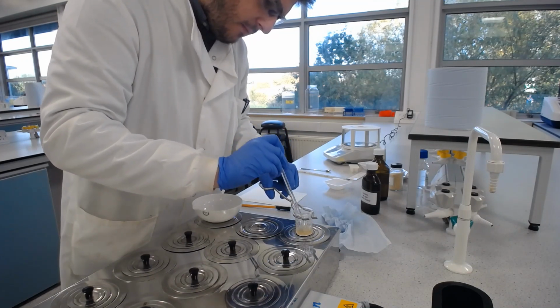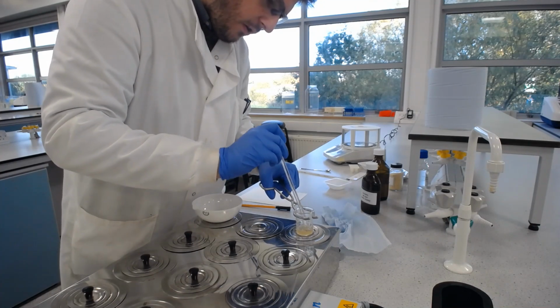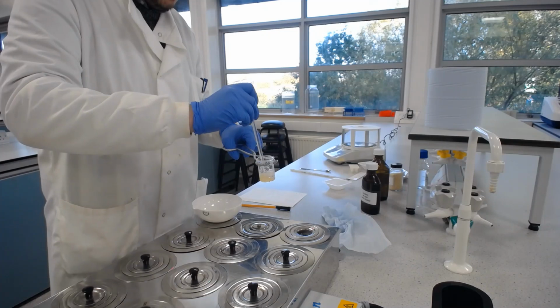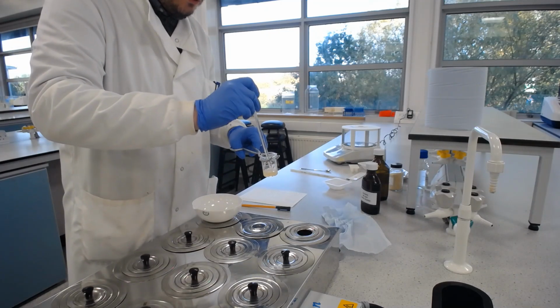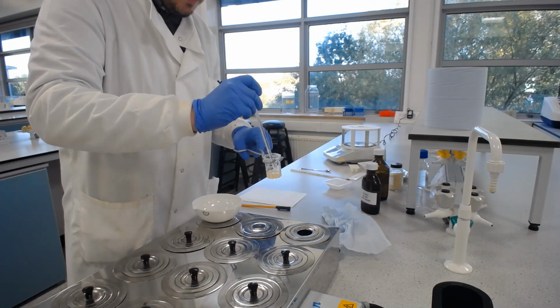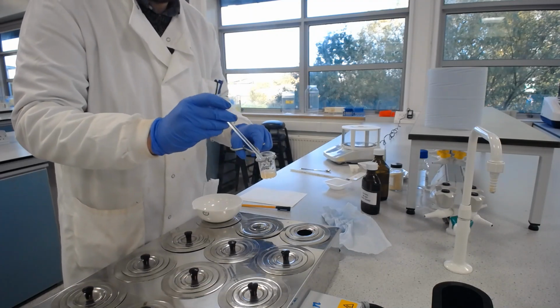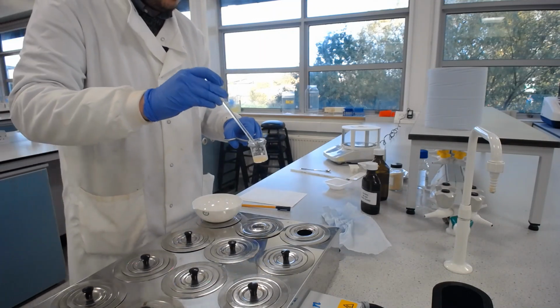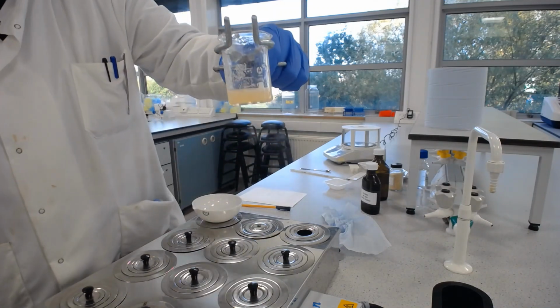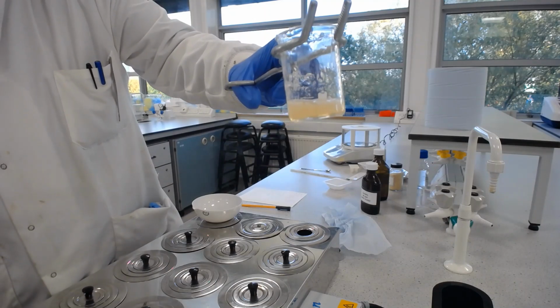And all this time, we need to be making sure as well, which I'm just about to do, that we don't remove too much water. Of course, if you do remove too much water and you want to save the product, you can warm up some water elsewhere and then add in that warm water to this. Think about why we wouldn't want to add cold water. You can see now I've started to get some of those grains from the top into the bottom.